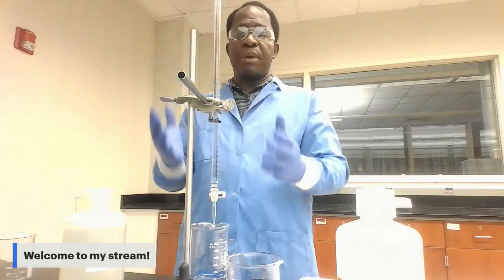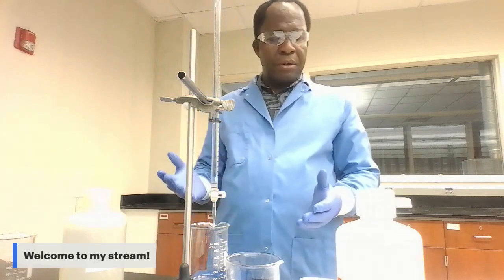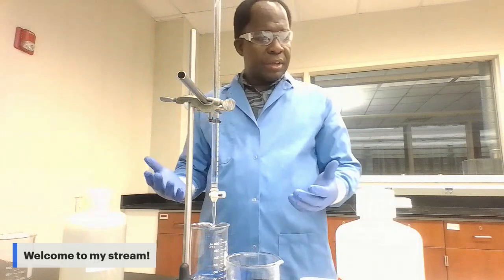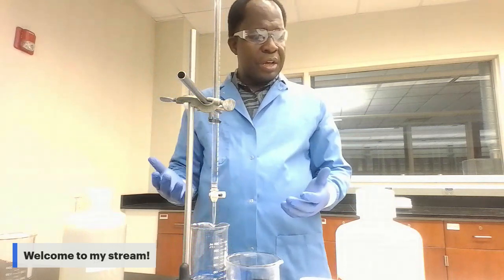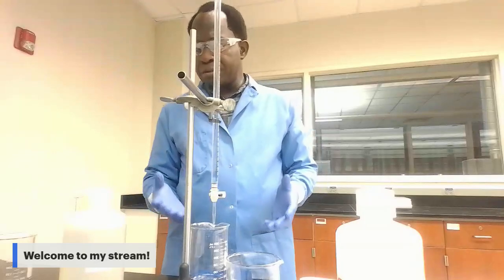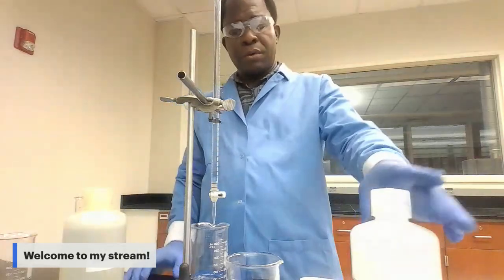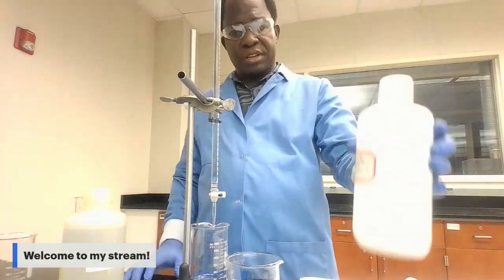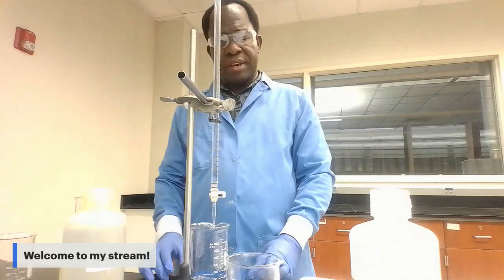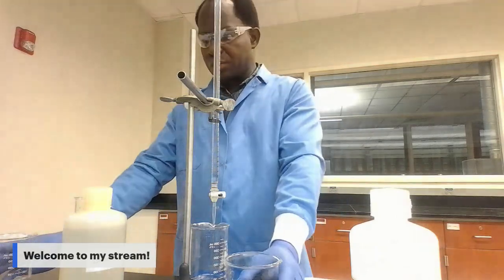This is what we have in place now for the titration. Now the burette is ready. We're going to move to part two, the titration. But before you do that, you need the Ca(OH)2 solution. You're going to titrate that solution with the HCl, so you have to prepare the Ca(OH)2 solution also.